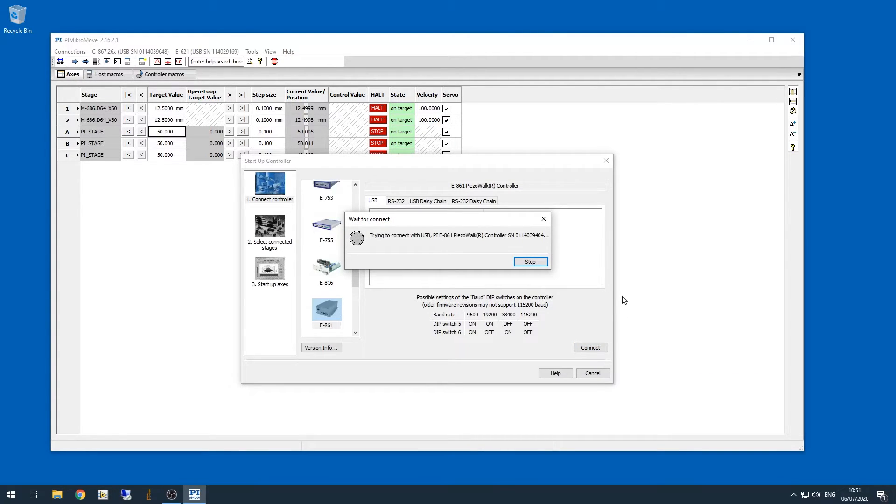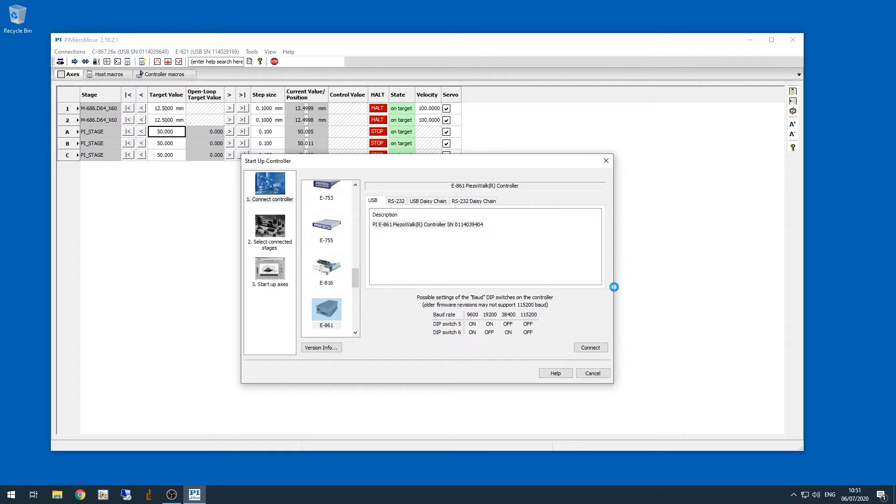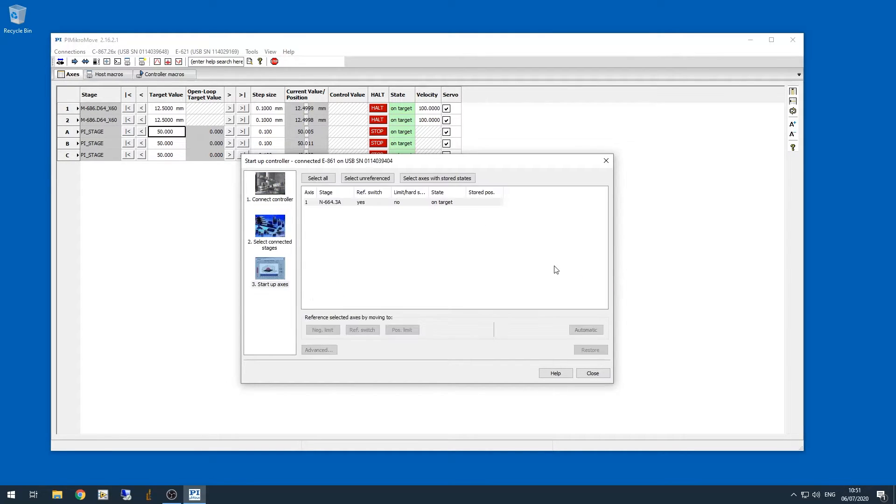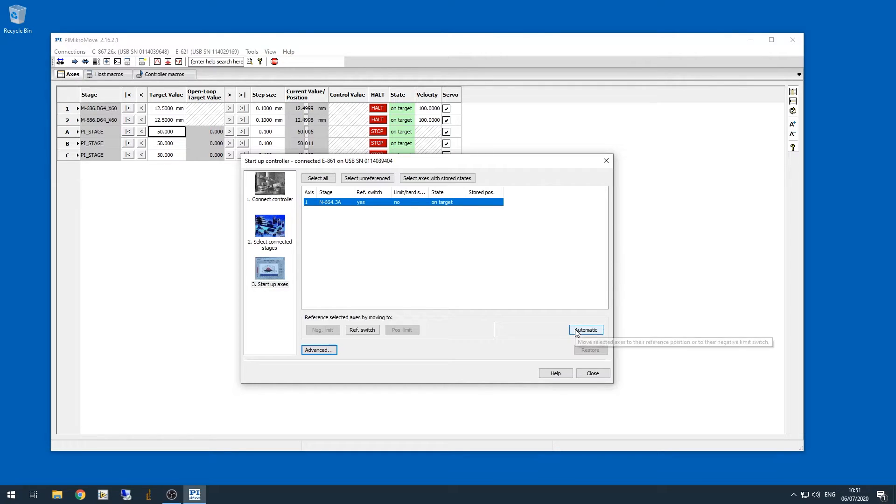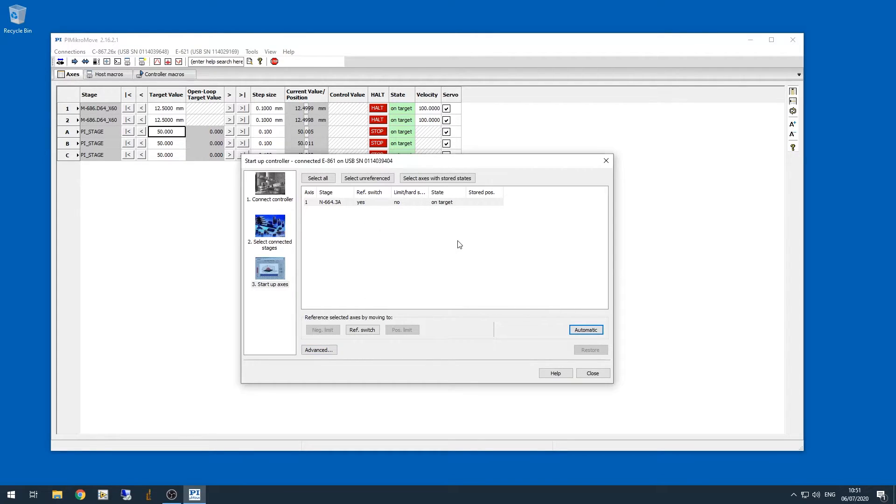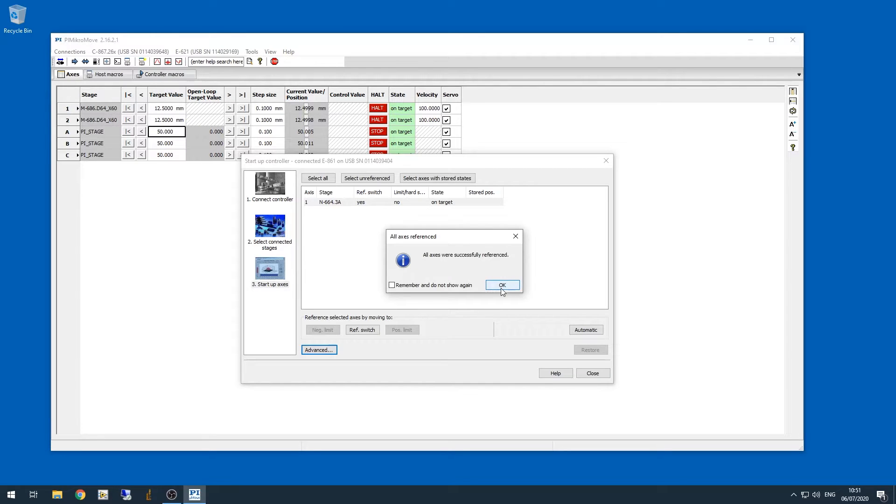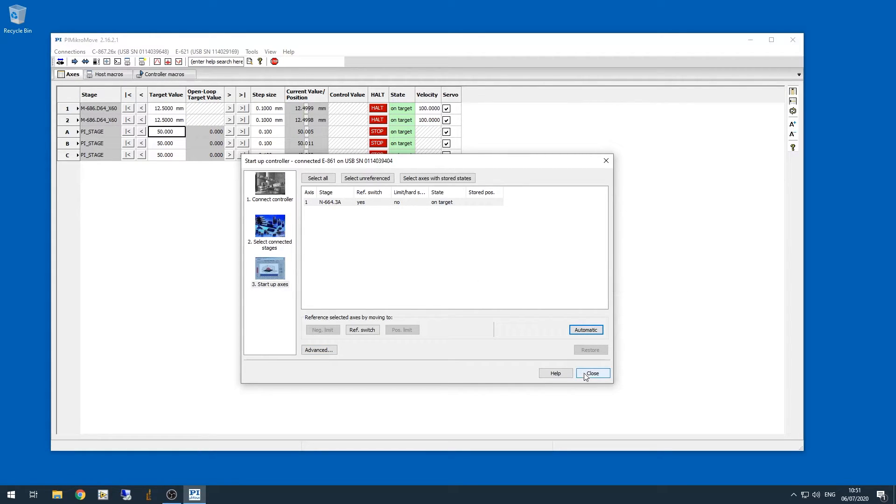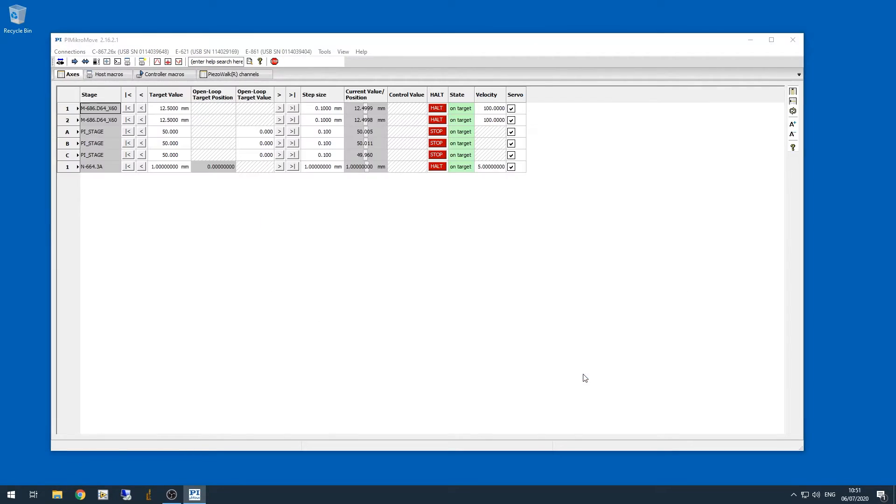We're waiting for the connection. Now the first time you connect, it's a good idea to reference this stage, so I'm going to select the axis and click automatic, and then click start, and now it's moving the stage to try and hit the limit switch. Now that's done, so I'm clicking OK, and then we can close this window.